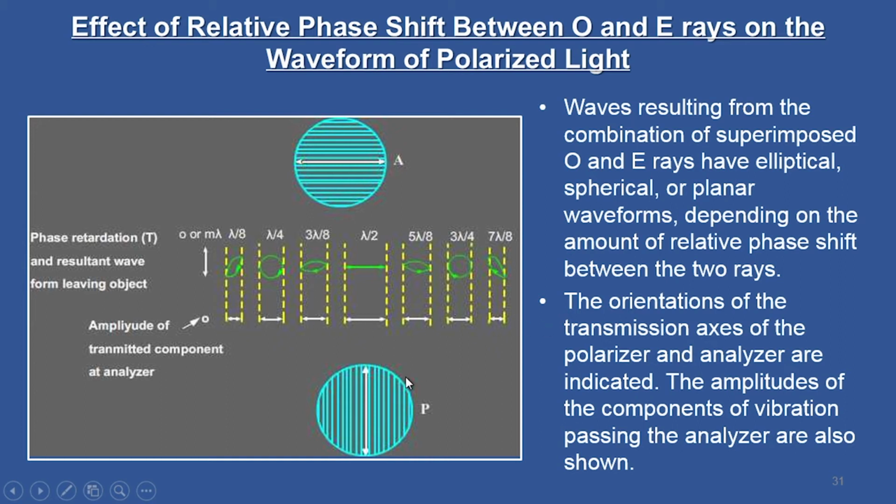That means with the polarizer and analyzer, depending upon the rotation and orientation of their axes, you are able to manipulate the amplitude of the transmitted light coming from the specimen to the analyzer. This is the key to appreciating the manipulation of the amplitude of the transmitted beam from the birefringent specimen.